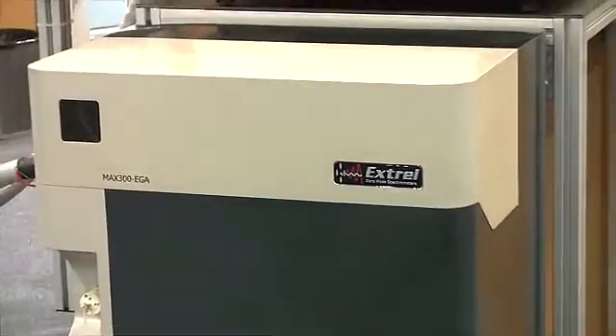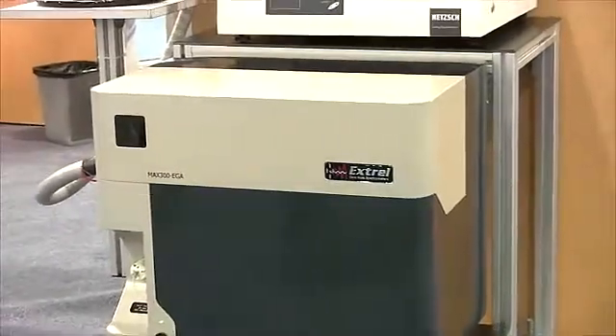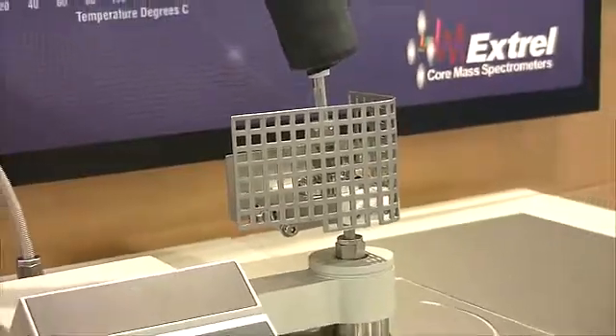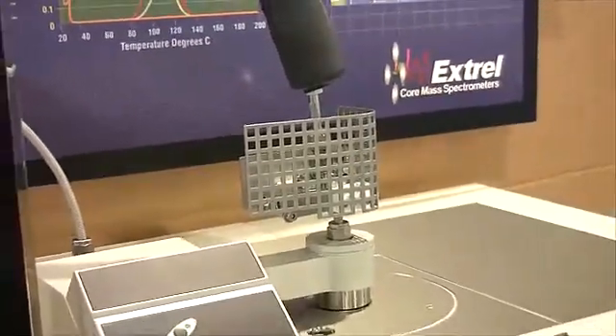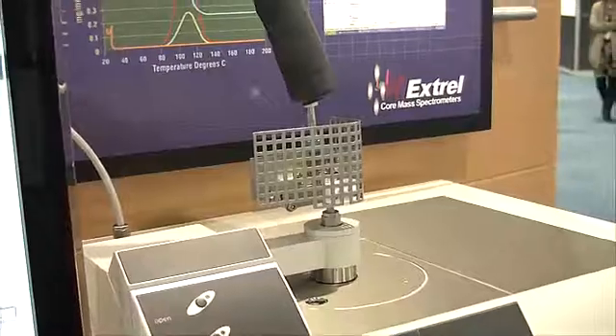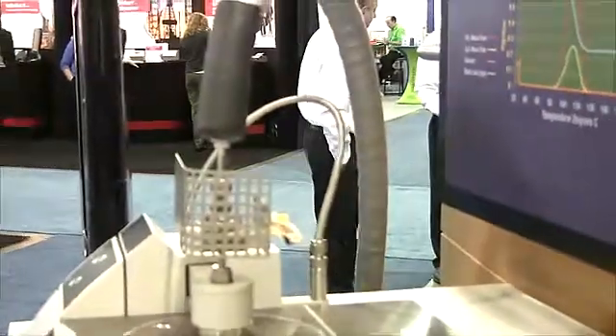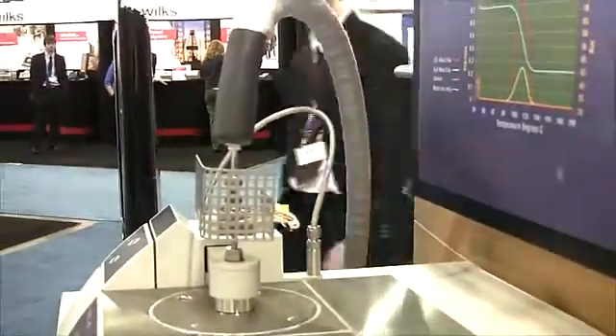High temperature samples must be kept hot and placed under vacuum as they are moved quickly from the TGA to the ioniser of the mass spectrometer. The transfer line on the MAX 300 is heated to 200 degrees centigrade, with hotter options available, and the interface design is selected based on the type of TGA or microreactor you are connecting to.